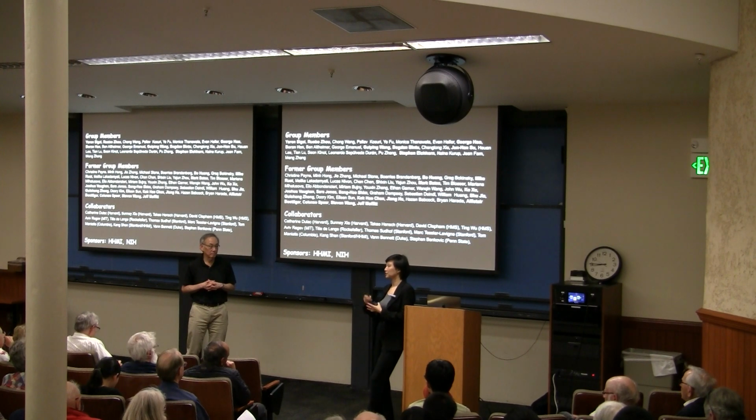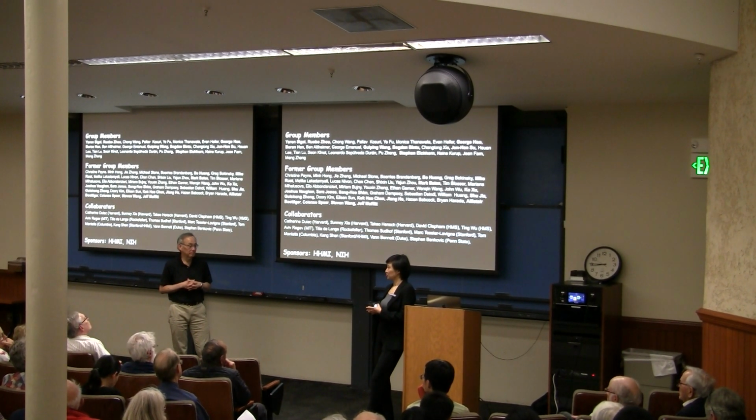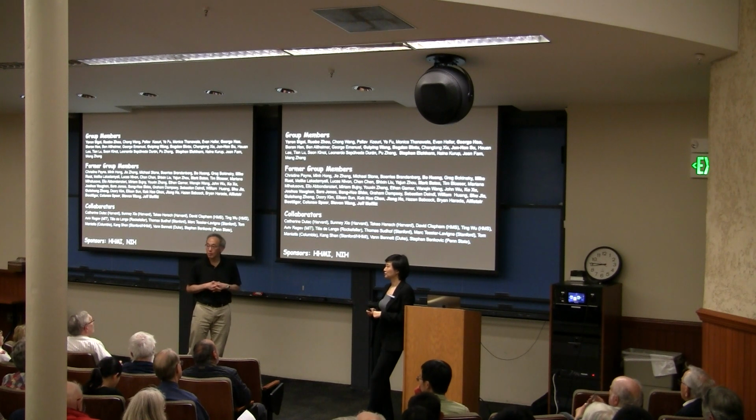And similarly, in the cancer microenvironment, you can look at how the immune cells interact with healthy cells and tumor cells. But you're absolutely right that just a fixed picture like this is not going to give you all the answer to how cells communicate, but it can generate hypotheses that we can further test.